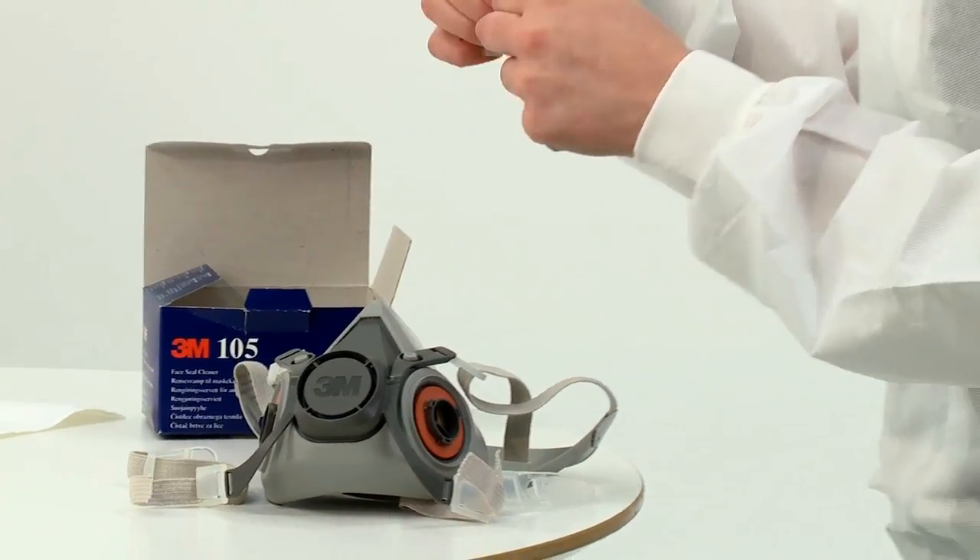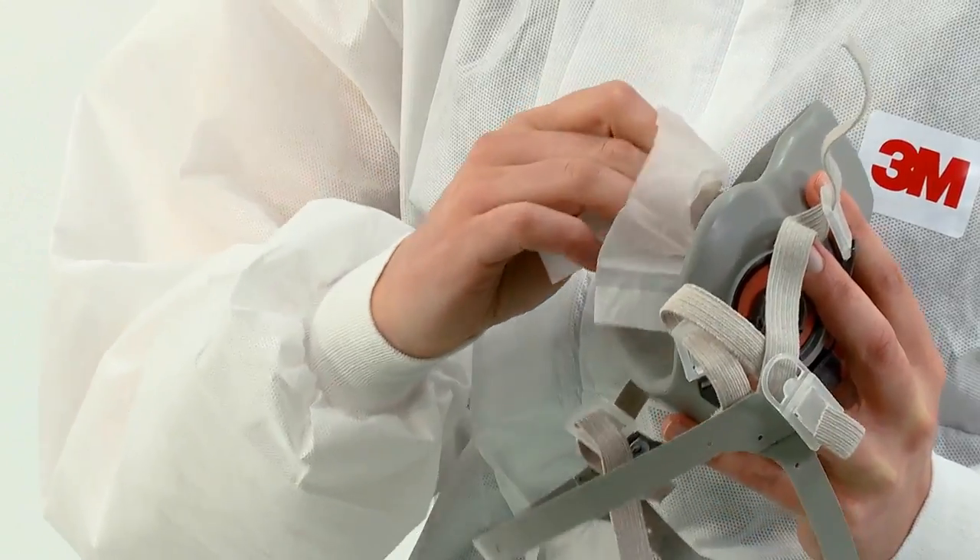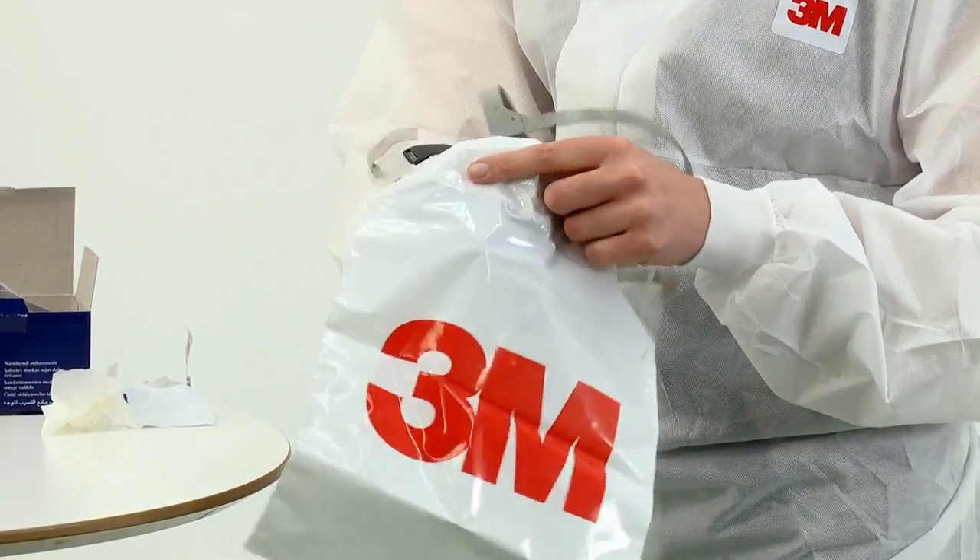The respirator should be cleaned at the end of each shift, dried at room temperature, and stored in the original packaging or a sealed container.